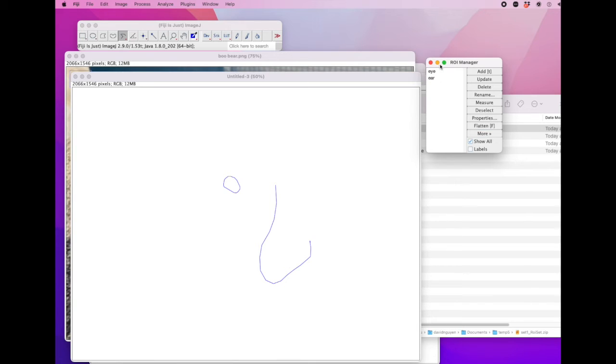Okay, and if I want to do just the ear, I click on that. But unfortunately, because I use the line segment tool, when you click on the ear, it shows all the squares too, right? And you don't want those part of your mask, right? And that's just one of the drawbacks of using the line segment tool, okay? And so if I want to have the ear only, what I need to do is delete the eye. And this is ear only, see, eye is gone.